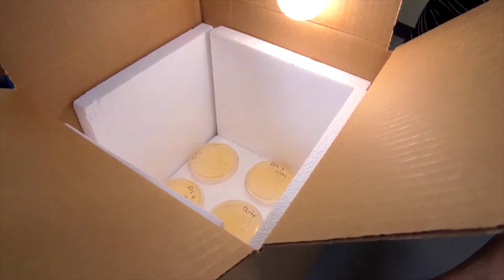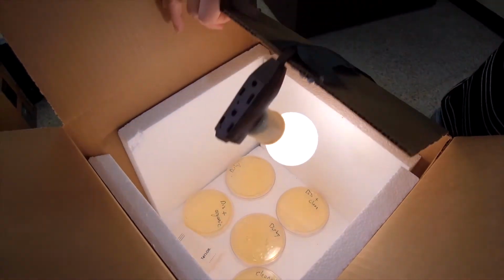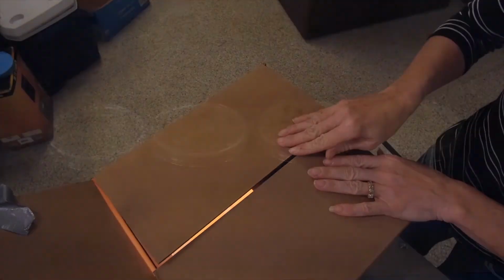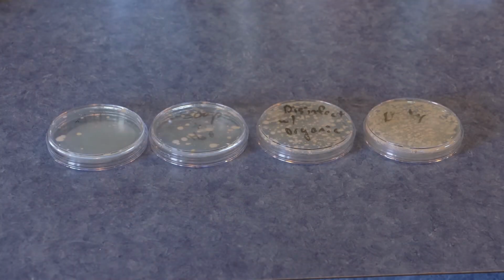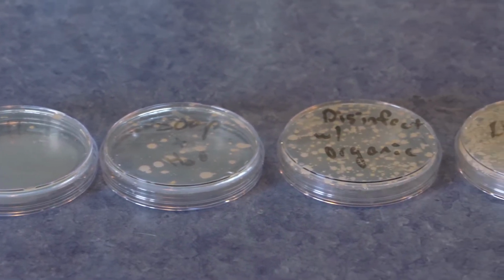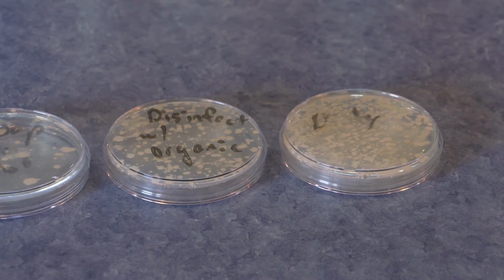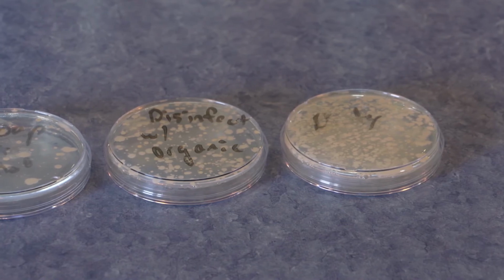So once our plates are in our box, we'll seal our incubator back up, and then we'll check back to see what's grown in 24 to 48 hours. Again, if you do grow, and you should grow some bacteria, just in case anything could potentially be pathogenic, make sure that those plates are disposed of properly.